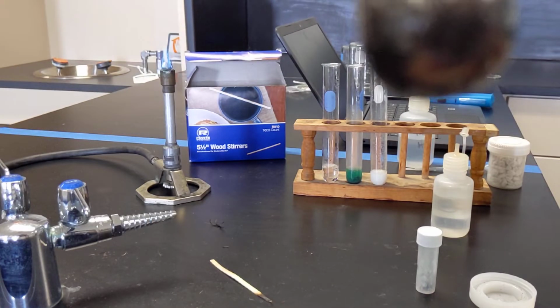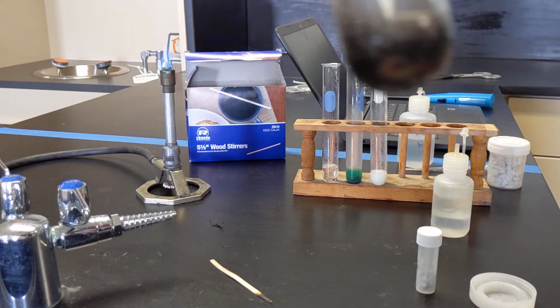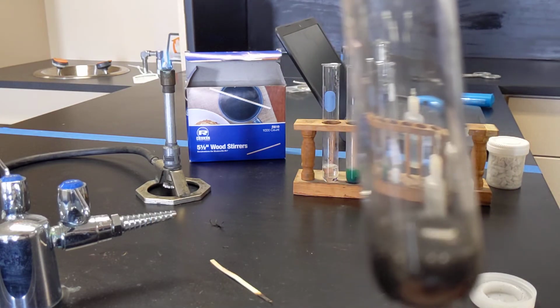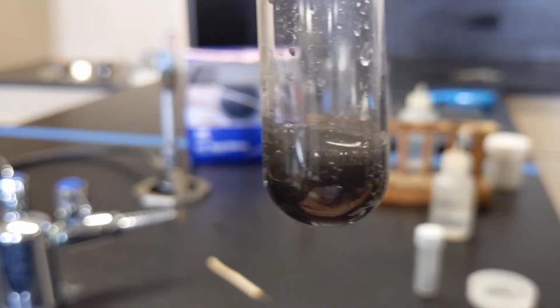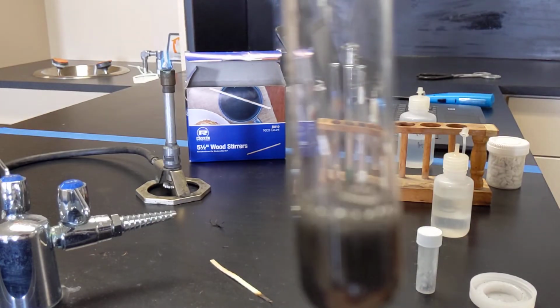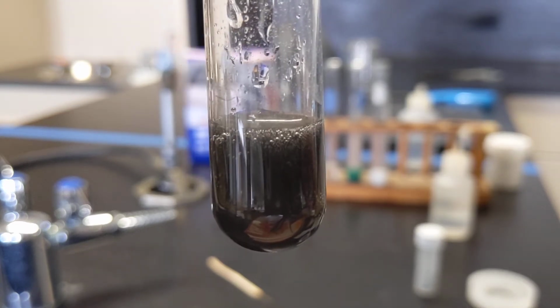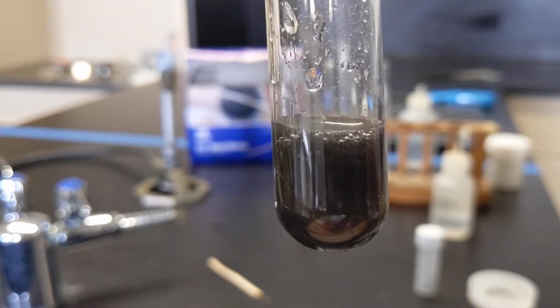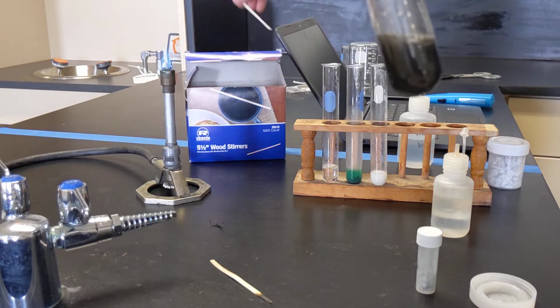I'm going to add a little bit more hydrogen peroxide to this because I do want to make sure I'm getting enough gas here in order for our flame test to be able to tell us anything about the identity of this gas. I'm going to grab a new splint because I used the last one to scoop a chemical.